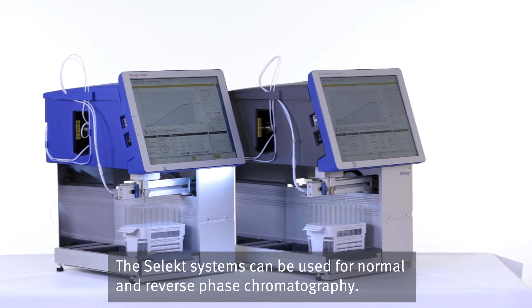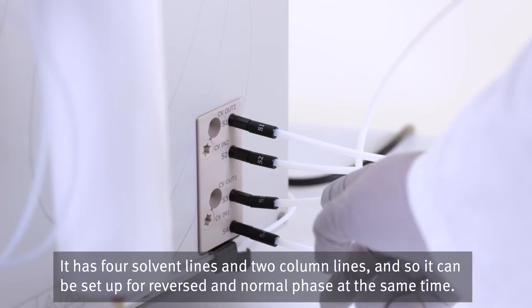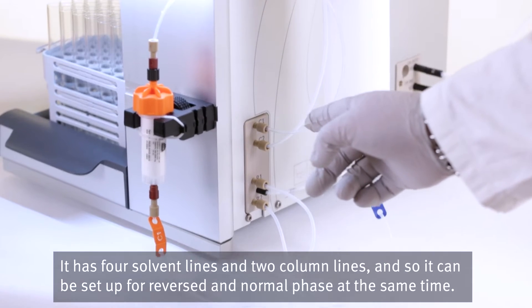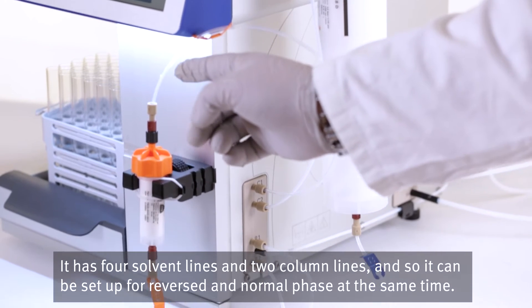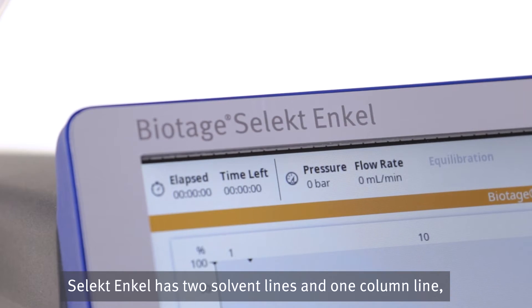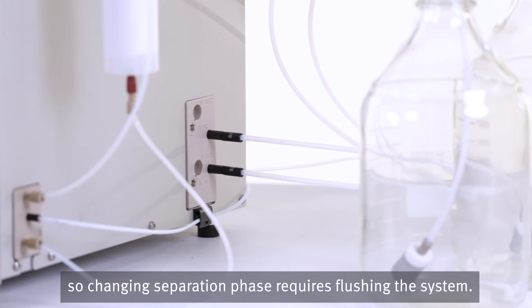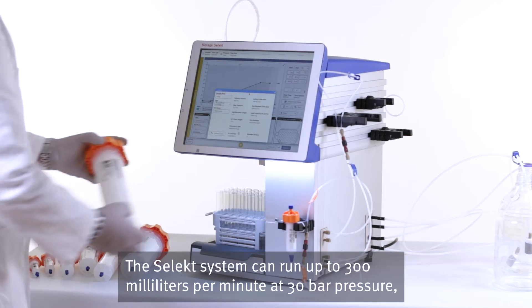The Selekt systems can be used for both normal and reverse phase chromatography. It has four solvent lines and two column lines, so it can be set up for reversed and normal phase at the same time. Selekt Enkel has two solvent lines and one column line, so changing separation phase requires flushing the system.